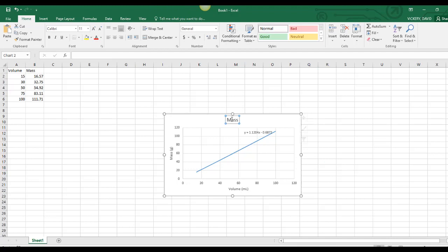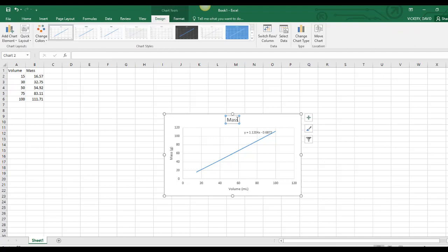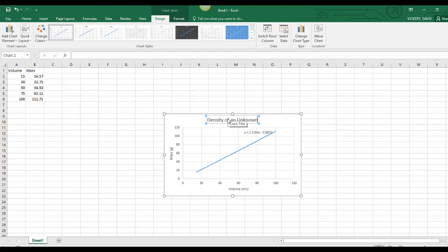I'm going to rename my entire graph to Density of an Unknown Liquid. This protocol will work for any unknown liquid.